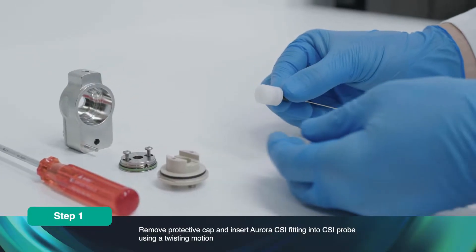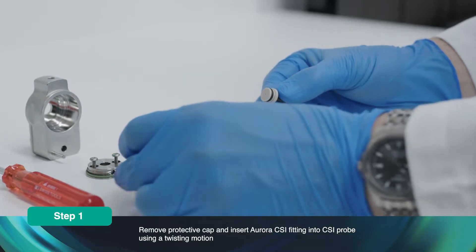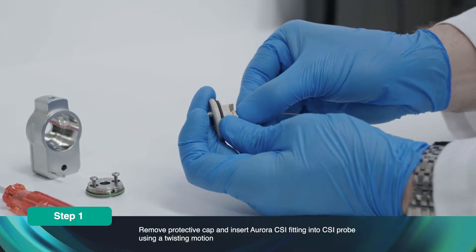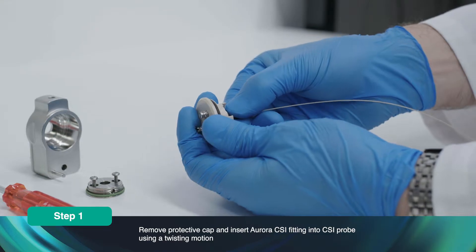Carefully remove the Aurora CSI protective cap. Insert the Aurora CSI fitting into the CSI probe. Use a twisting motion to prevent pinching of the rubber seal.